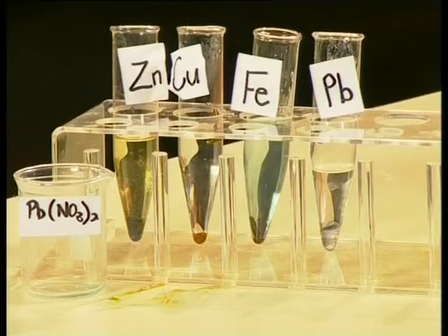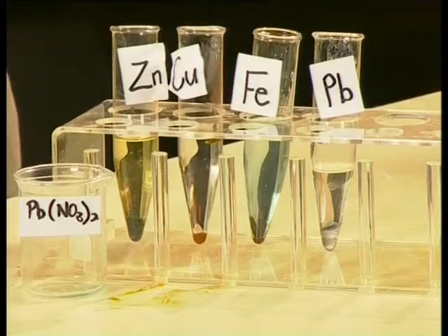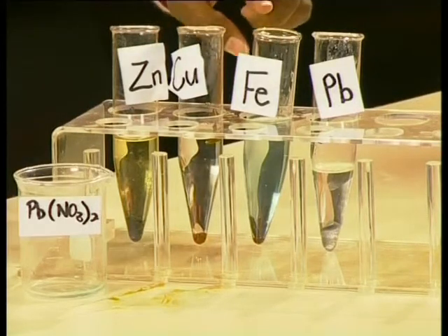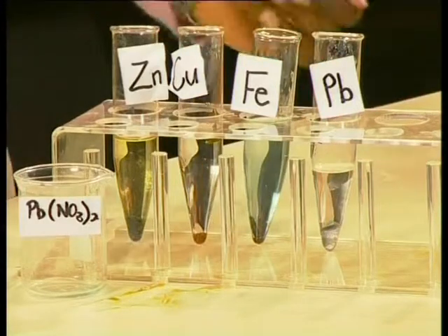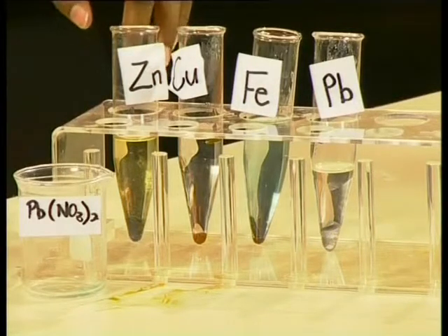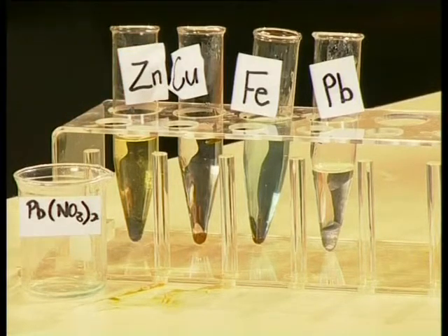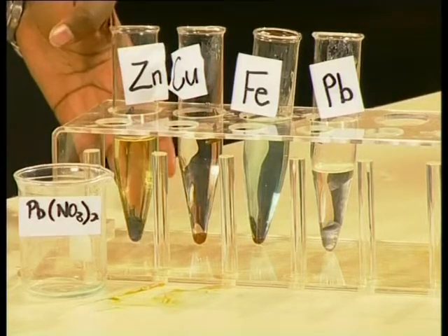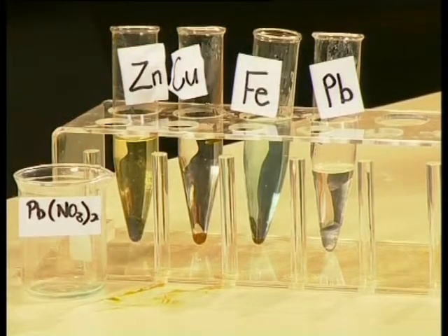In the first test tube where we placed copper into the solution, there is no change. But in the test tube containing the iron nail, we see that the solution turned a pale green color. The iron nail is also covered with a dark coating. The solution with the zinc has not changed, but has become murky because of the zinc powder. You should also be able to see that the zinc is covered with a similar dark substance. There is no change in the test tube containing the lead, but that is to be expected. I've put all of our results into a table.